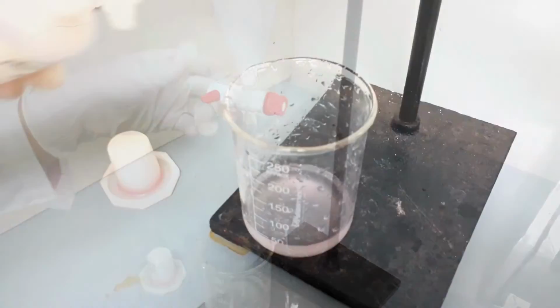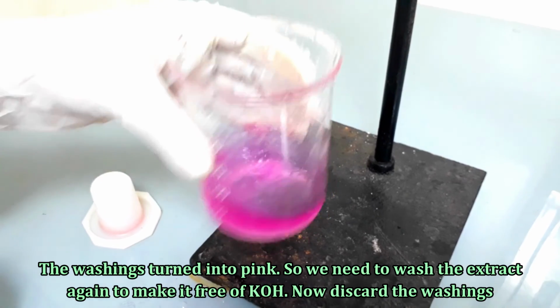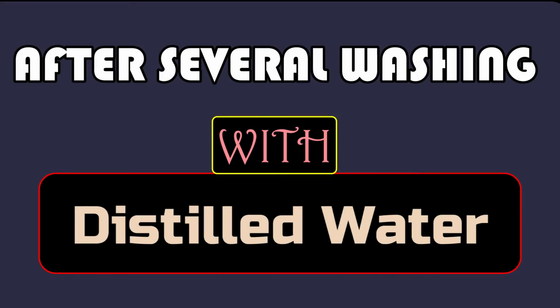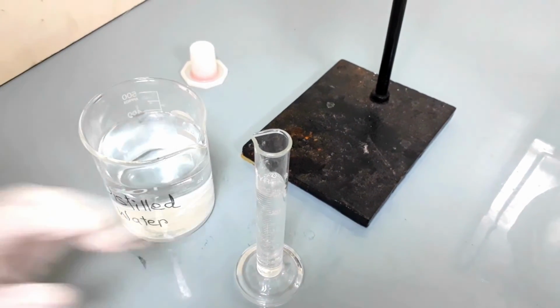Add a few drops of phenolphthalein indicator solution into the washings. Washings turned light pink, so we need to wash it again. Wash the extracts with distilled water as done previously.